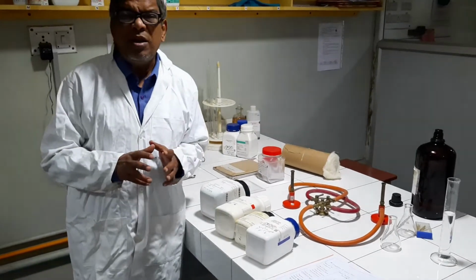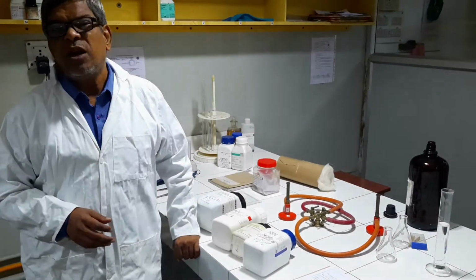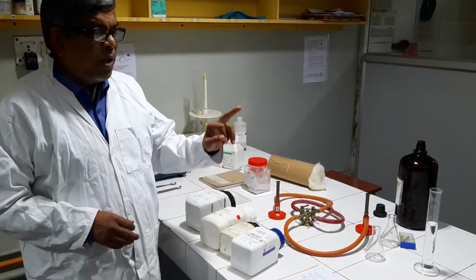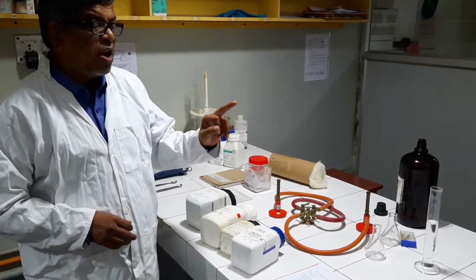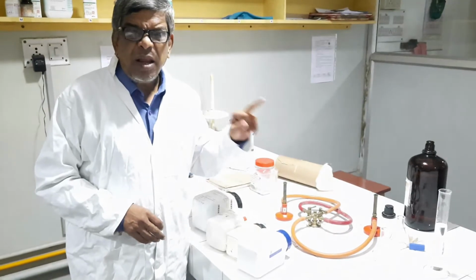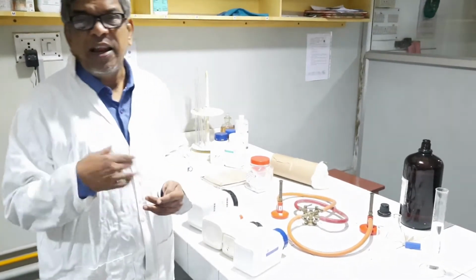In microbiology, I will take a class on water: what are the different types of water used in pharmacy? This distilled water will be used for preparation of media, and the volume will be adjusted up to the neck. Then it will be given to the autoclave for sterilization.